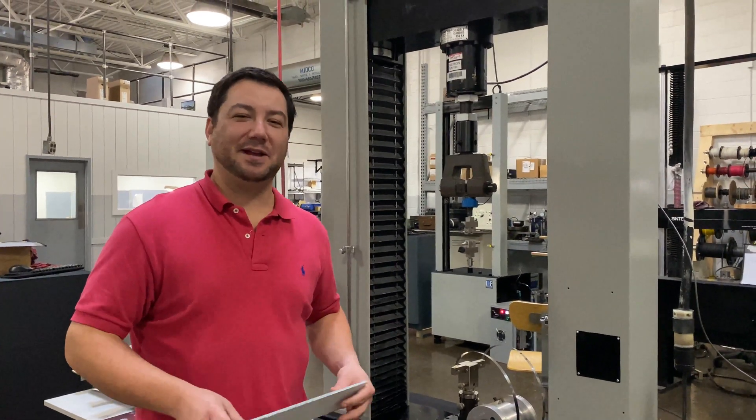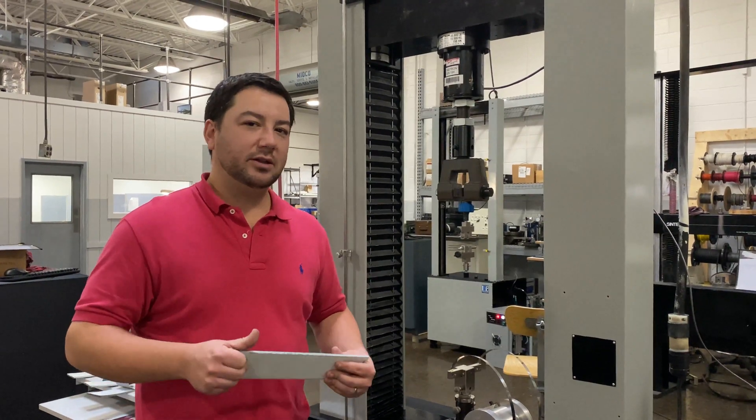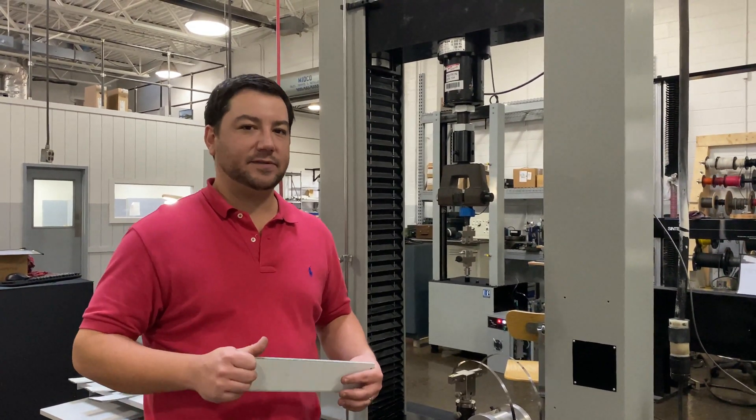Hi, this is Jeff over at Frank Bacon Machinery. Today we're going over ASTM D1781, the climbing drum peel test for adhesives.